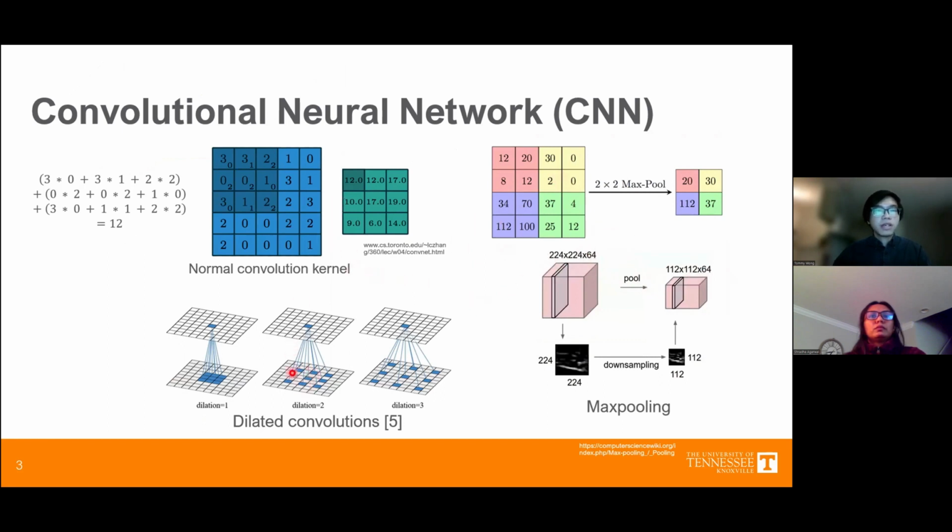So the convolutional layers contain all the neurons, and each filter has a specific number of neurons, and when it slides through an image or an input, then a convolution is performed on that region, by multiplying the weight of each neuron with the pixel at that location, and then taking the sum of it, it yields the output.